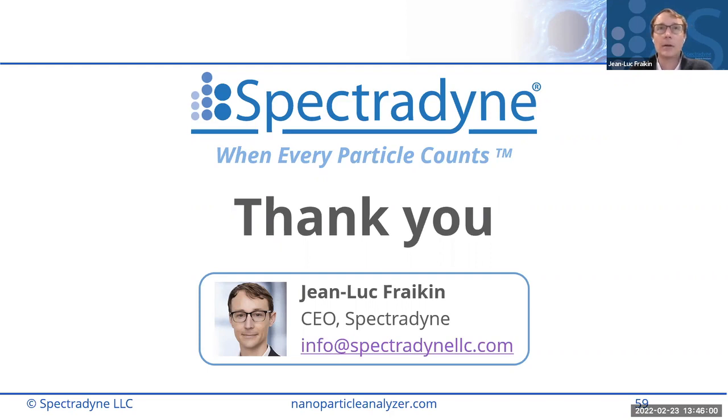In terms of how hydration affects particle size on our system, on the MRPS system, basically anything that changes the volume of the particle will affect our measured size of it, right? Because we're measuring the volume of the particle. So if you can make the particle swell by changing the osmotic pressure or something like that, then we should be able to detect that. Does that answer your question? Thank you. Yeah, thank you.